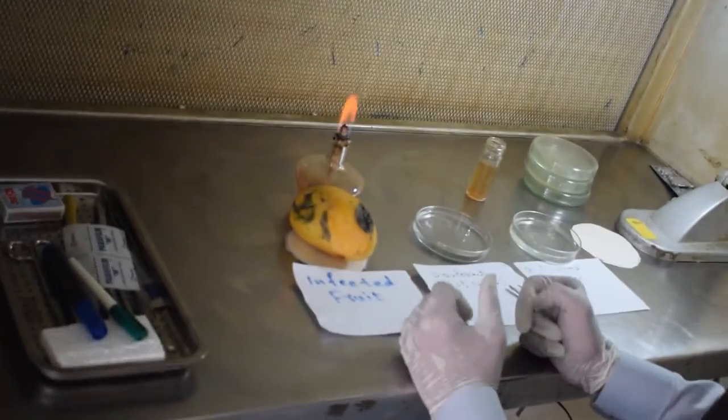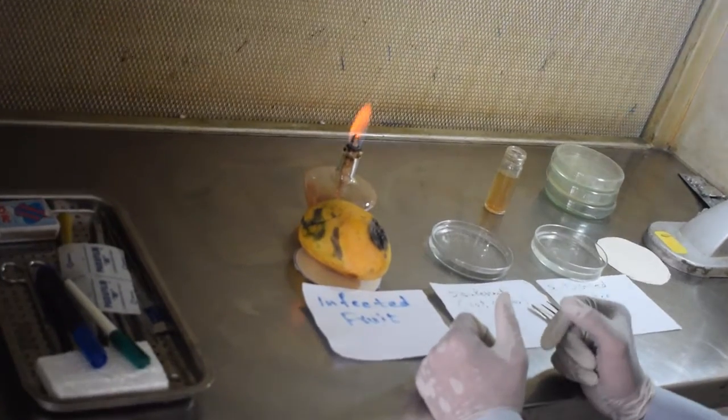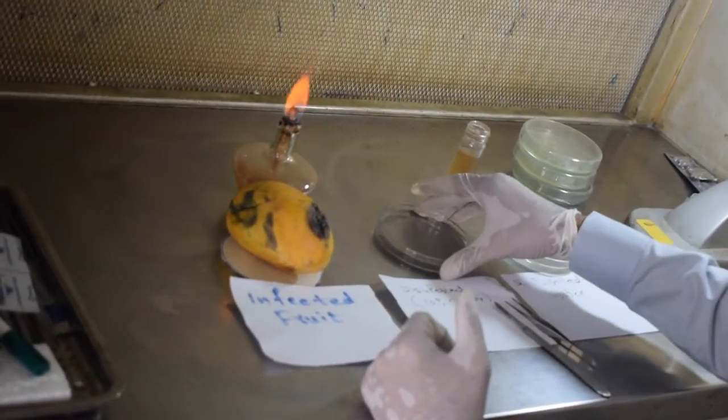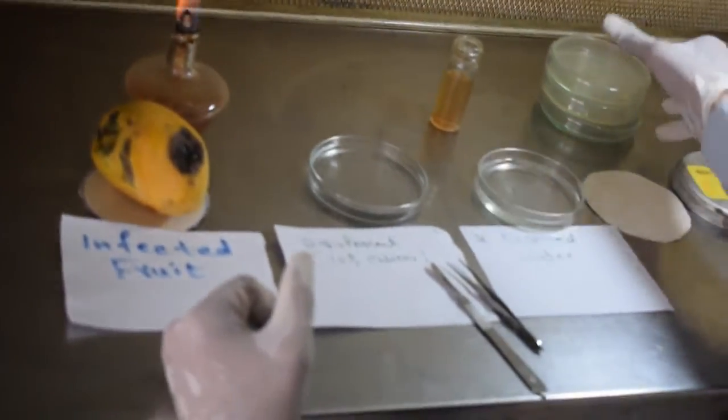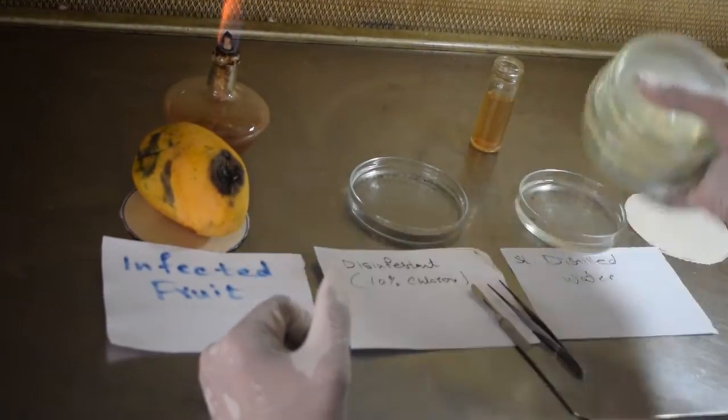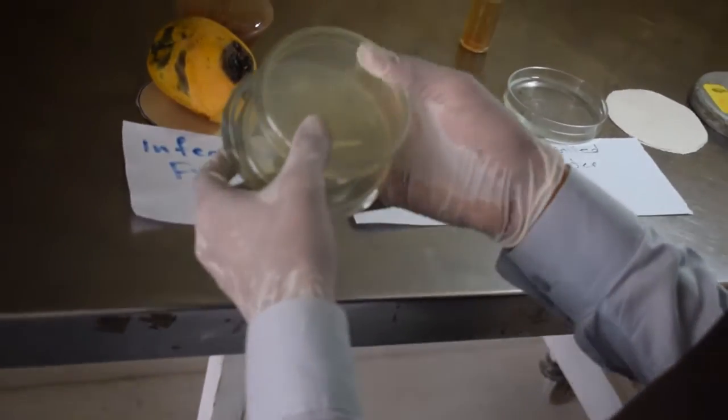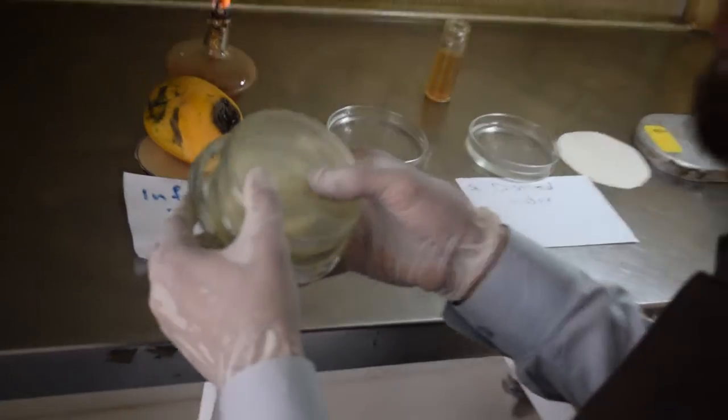We need the burning spirit lamp, the disinfectant Clorox 10% and distilled water, the blotter paper, and last but not least, the petri dish filled with the medium.